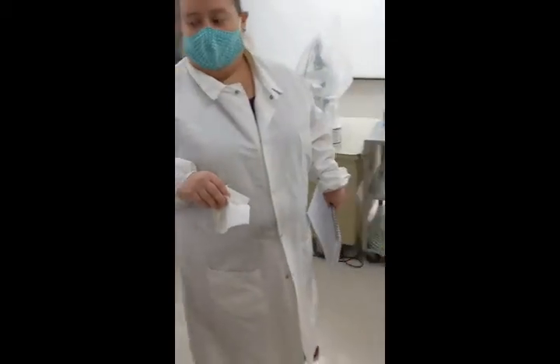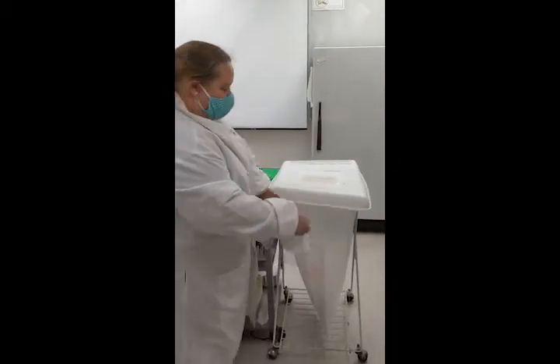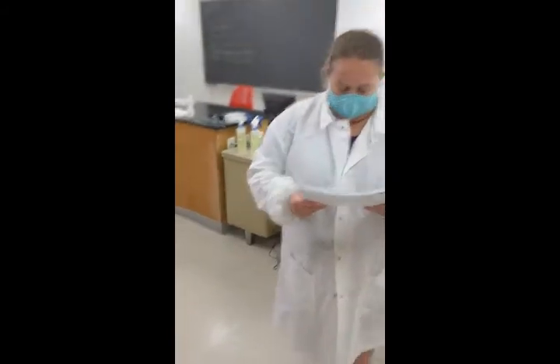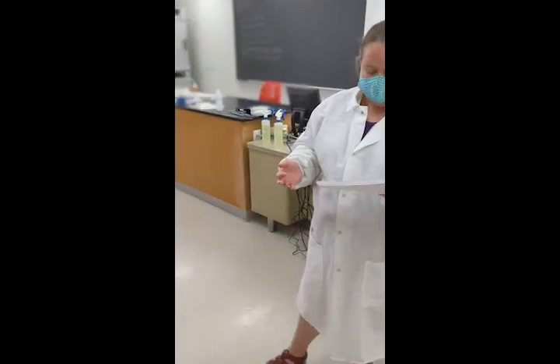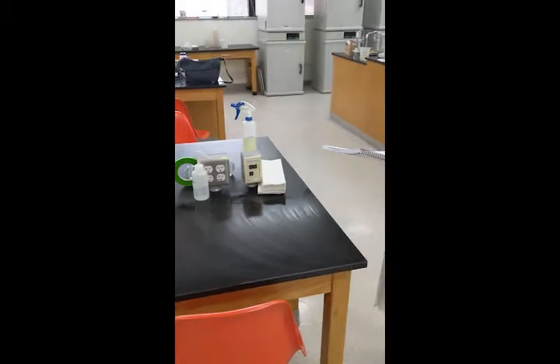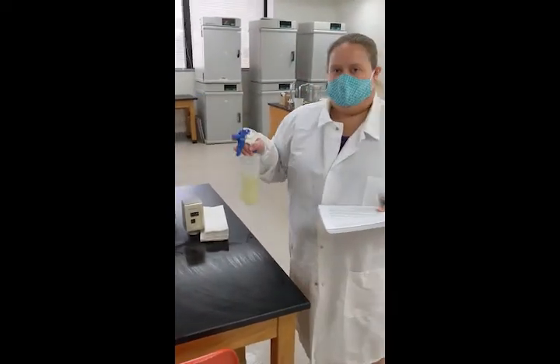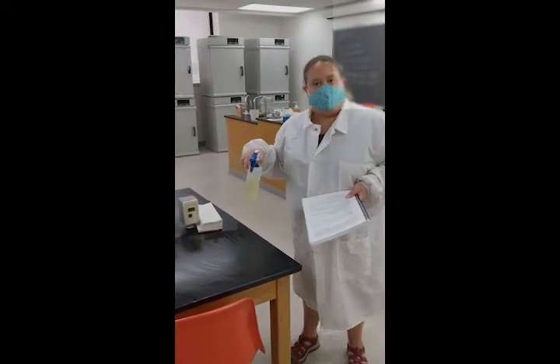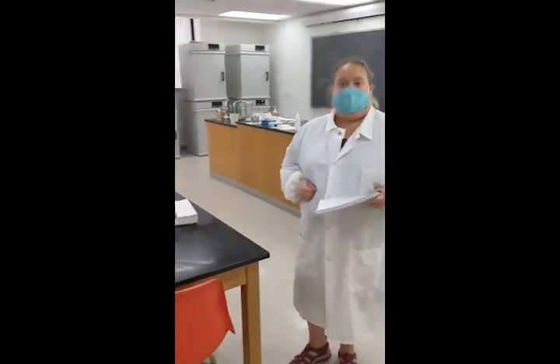When you're done, your paper towel can either be discarded in the trash can, or if there are microbes on it, it should be discarded in the biohazard box. If you do happen to spill your culture of microorganisms, you want to completely cover the area with the disinfectant we just used to wipe off our table. You should then notify your lab instructor. If there's any broken glass, your lab instructor will take care of cleaning it up.